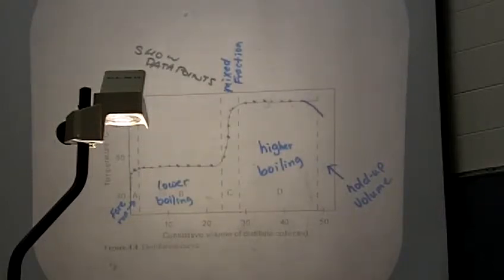So you don't want to start at a setting of 80 because it's really easy to overshoot your low boiling component, okay? So I'd probably start to where you just start feeling heat at the heating mantle, and then just very carefully but vigilantly. This shouldn't take all 5 hours to do the distillation, so that's why you have to stay on it, but not overshoot it, turning up the voltage on your Ohmite, okay, for your distillation, all right?